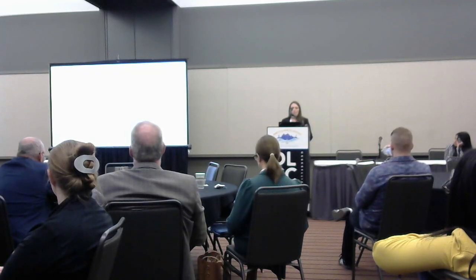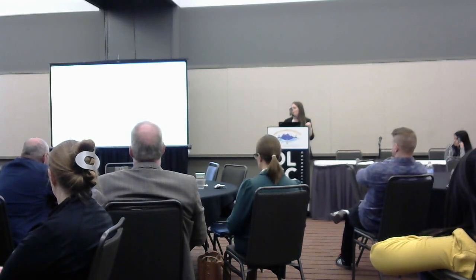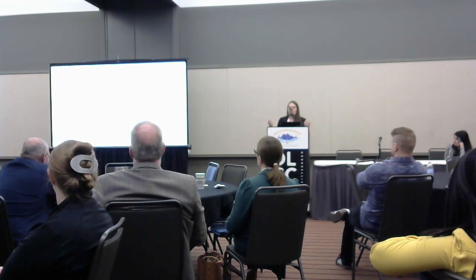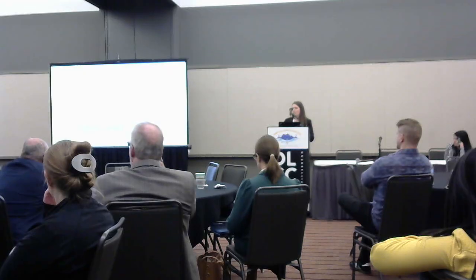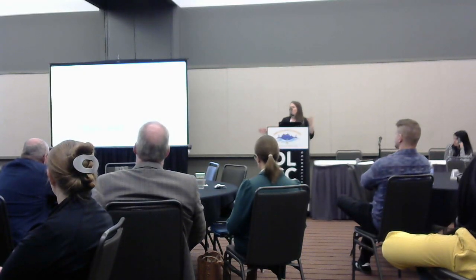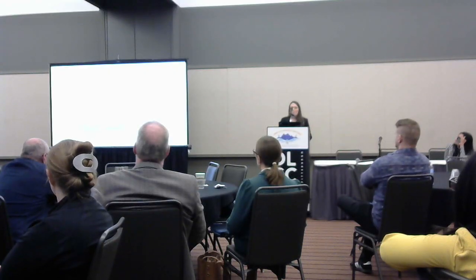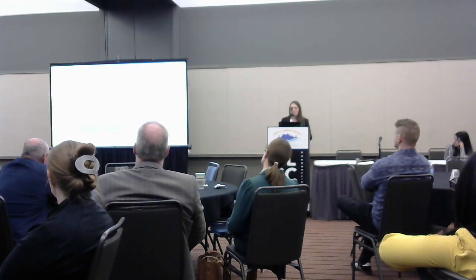In the immersive workshop, our outline for what we were teaching started with what's an image, how do we assess image quality, and then built on top of that as we went. So how can we derive information from intensity values? What if that doesn't work? How do we pre-process? How do we post-process? Then what do we consider when we build reproducible pipelines? What do we consider when we think about statistics? Big picture, what does the analysis process look like when we're starting a new project? And all of this was done with one continuous data set. So they were very familiar with the data set.